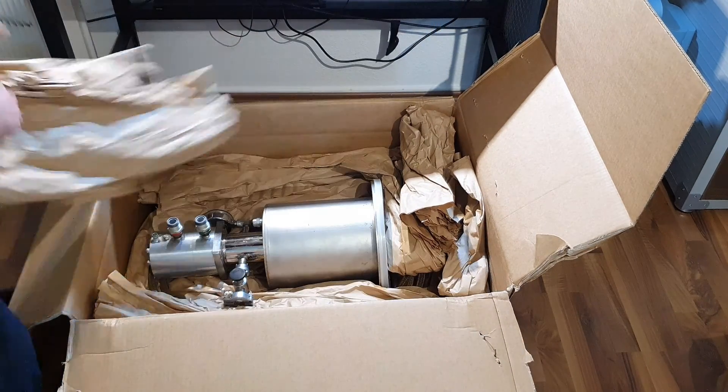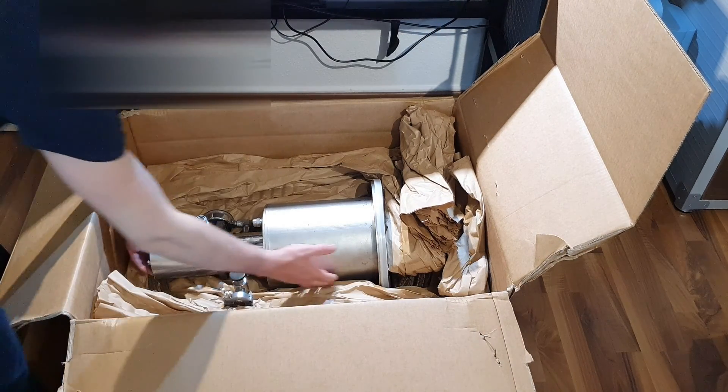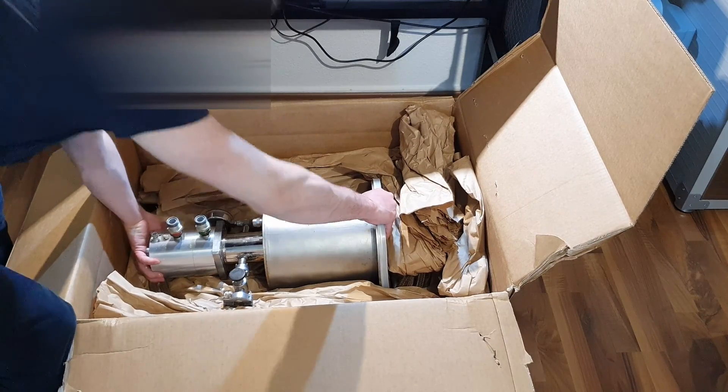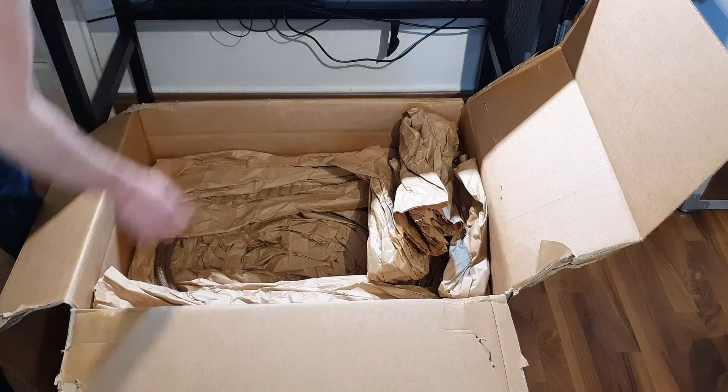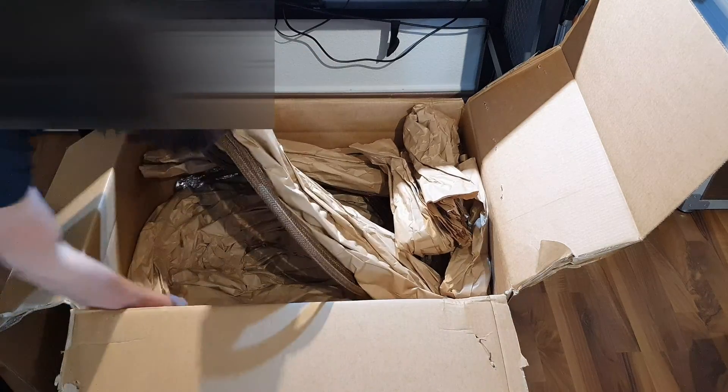I have a new toy. It's a cryo pump used for high vacuum applications. This pump is capable of temperatures down to 10 Kelvin, which means 10 Kelvin warmer than absolute zero.